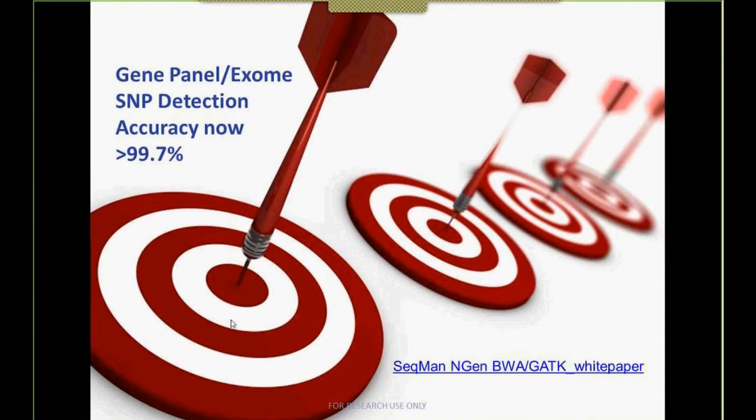So there are millions of variants for this genome that have been verified through multiple methods. So we're very confident where the variations are in this data set. It's the perfect data set to use to calibrate software. And once we had access to that Genome in a Bottle data, we were able to fine-tune all the different steps: the assembly process, the trimming, the SNP calling, the SNP reporting, the SNP filtering. You can always check it against that answer.